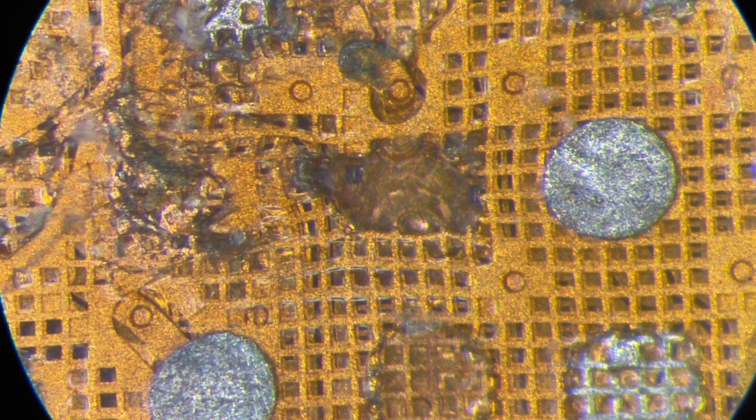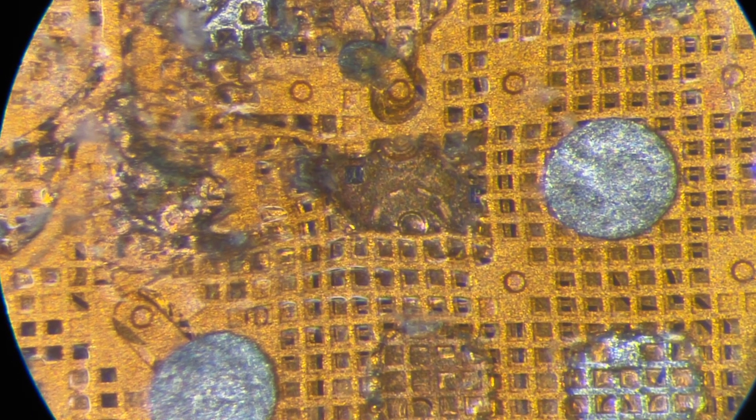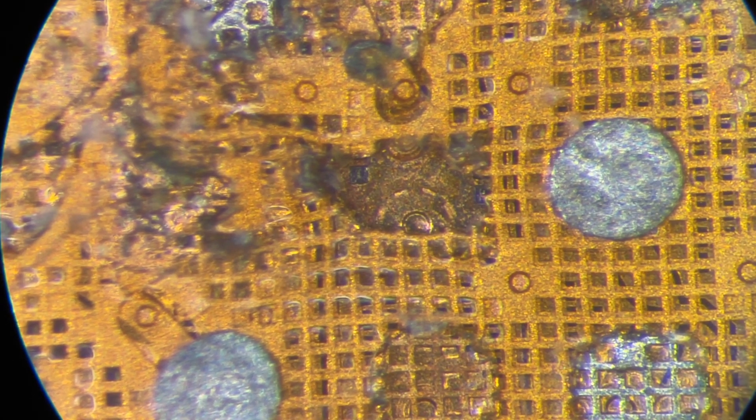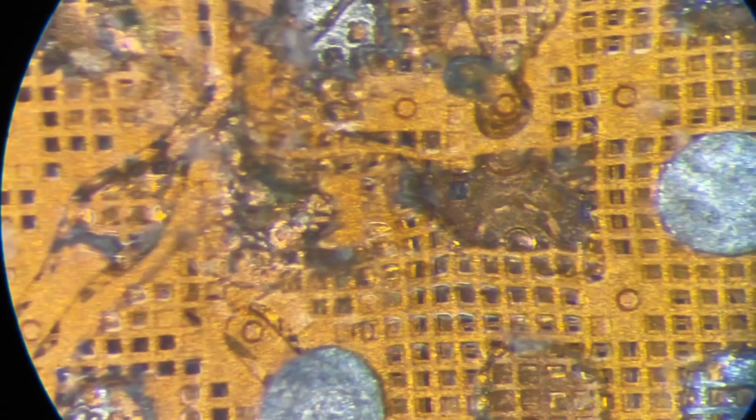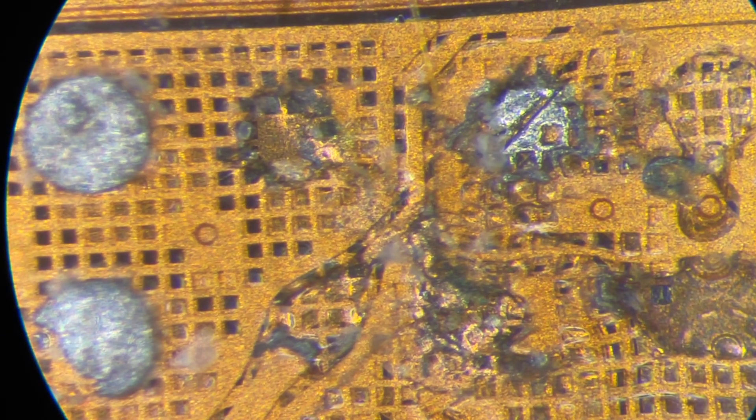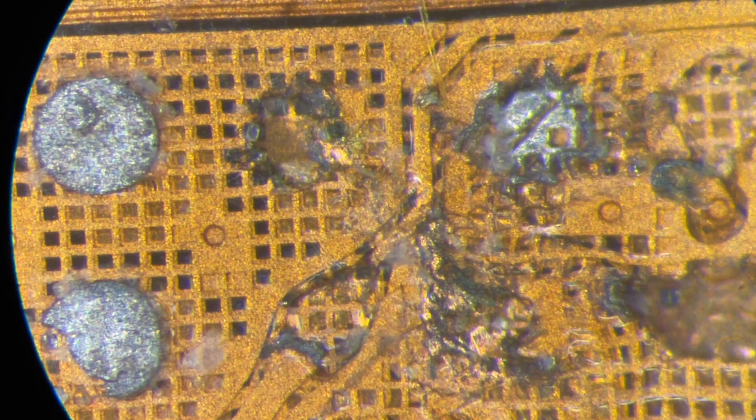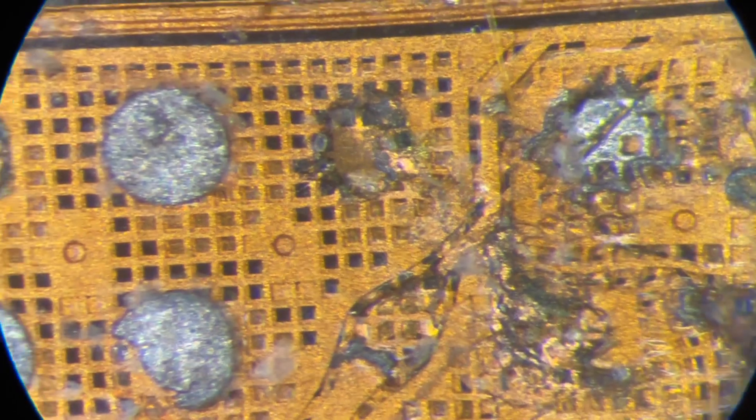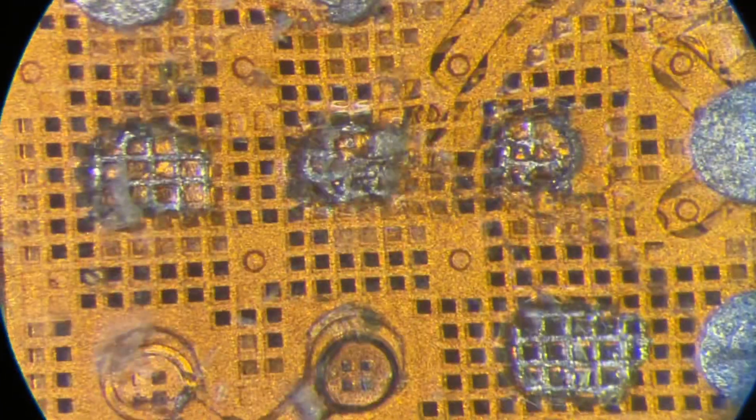There are different defects here, because I ordered Maxim to make them as much diversity as he could, so he made me a lot of defects here.